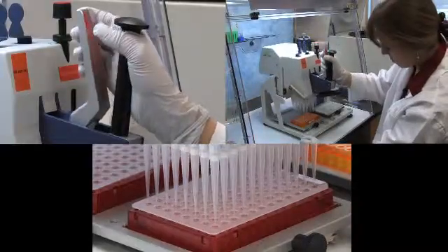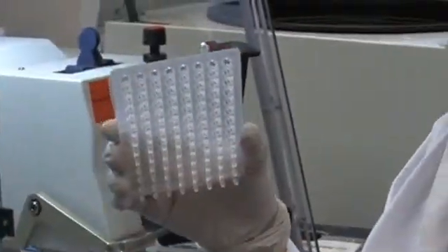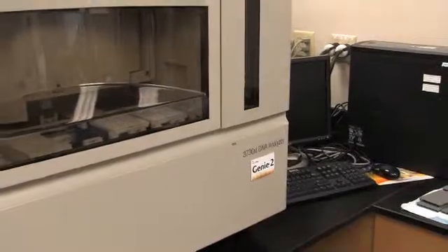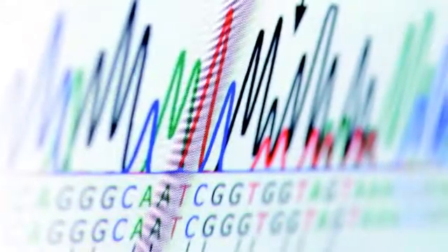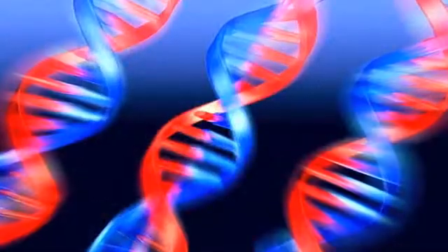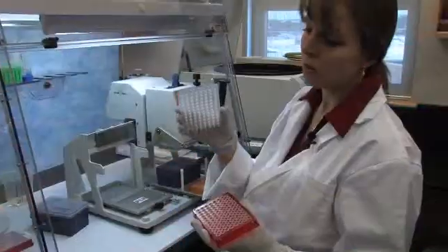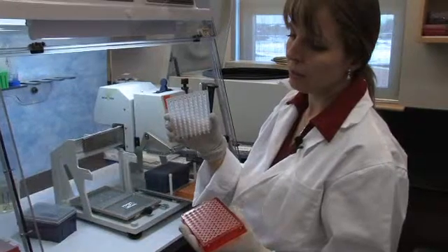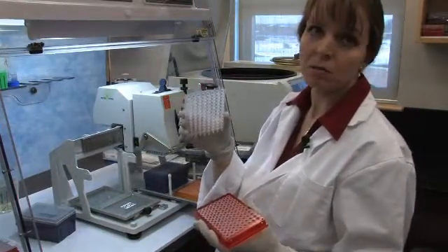Here is the CCDB's protocol for preparing a 96-well plate for cycle sequencing reaction. In the lab, cycle sequencing analysis is performed to obtain the nucleotide sequence of the barcode region. Cycle sequencing requires highly accurate and precise volume measurements and pure DNA samples. This pre-made sequence plate contains primer, reagents, and big dye terminator for the sequencing reaction.